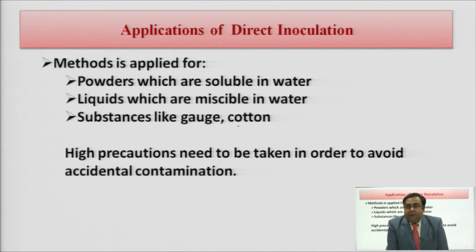A question may be coming up in your mind, why are we repeating this again and again? I am repeating this because if the environment where you are carrying out this test is not properly sterile, you will not be in a position to know, just by seeing the turbidity, whether the turbidity has been caused by the environment where you are carrying out this test, or whether it is due to the substance not being properly sterilized, that is your sample.